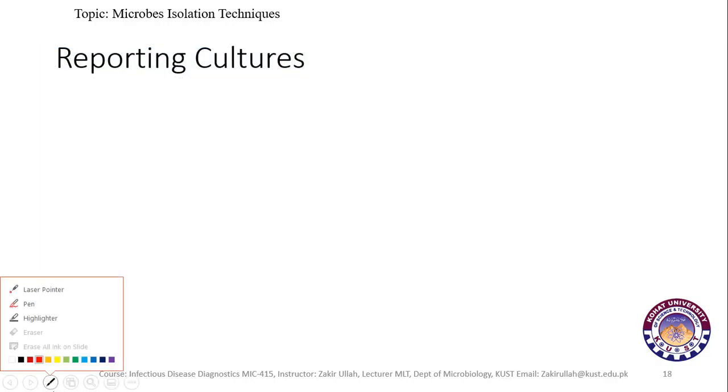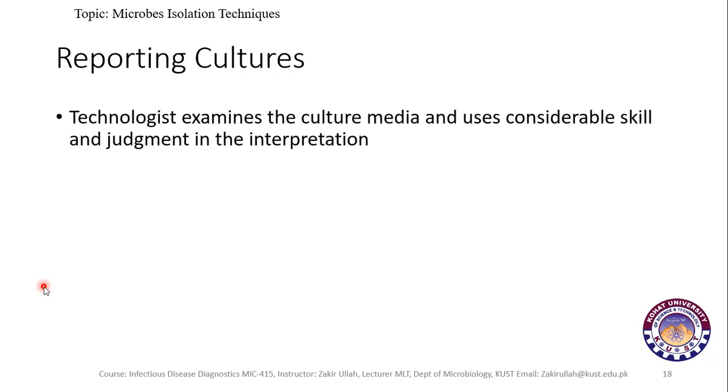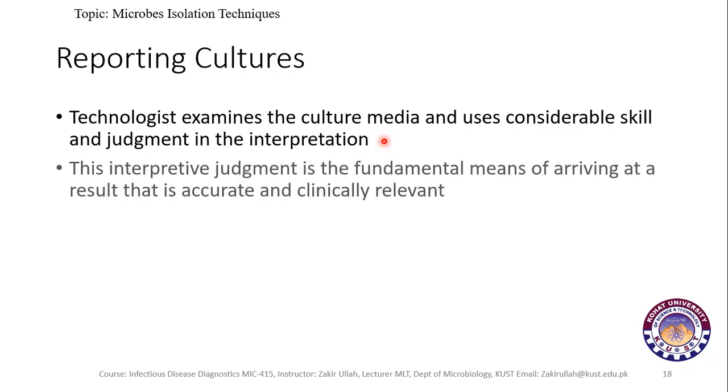Now, the reporting of cultures: how to report a culture and the growth that is being observed on the culture media. The technologist who is examining the culture media should use his skills and judgment to find out the organisms on the basis of the characteristics of the culture media, and he should know what kind of microbes have which type of morphological characteristics.